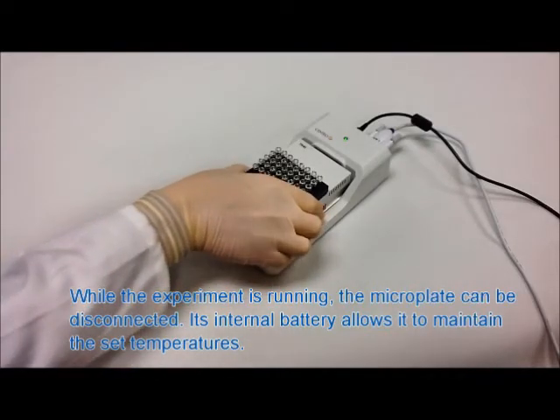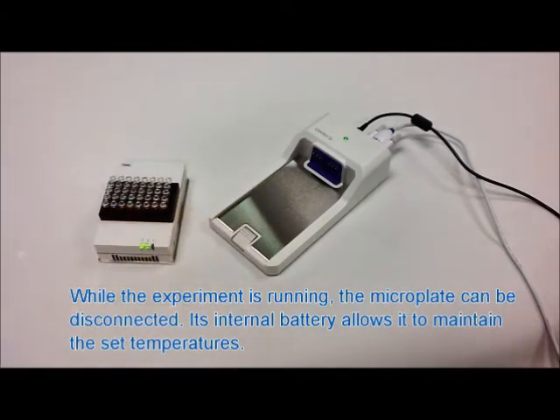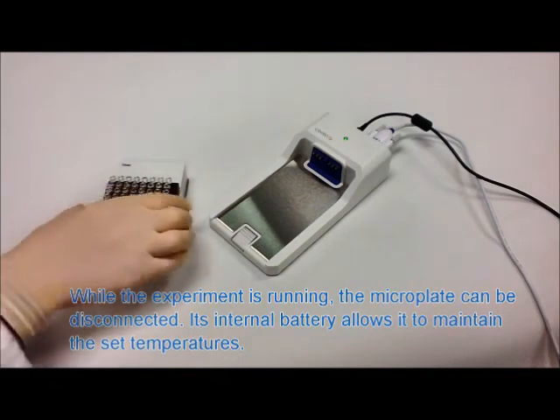The TR40 continues to run even when removed from the docking station, allowing scientists to move around the lab, view under the microscope, or even place it on a robot.